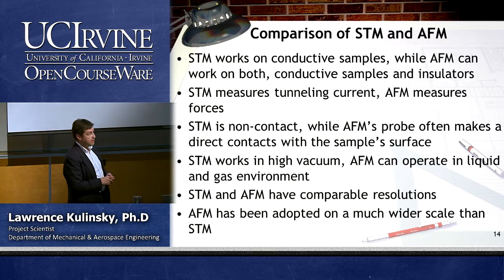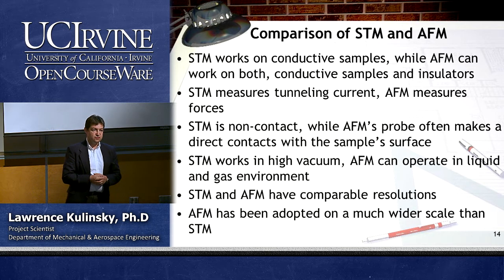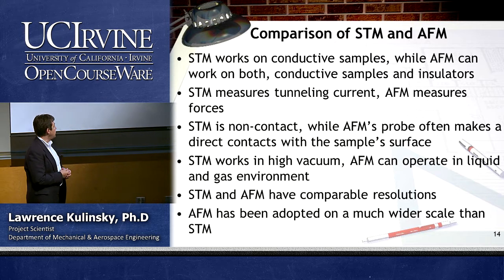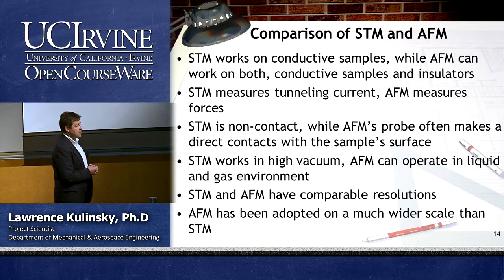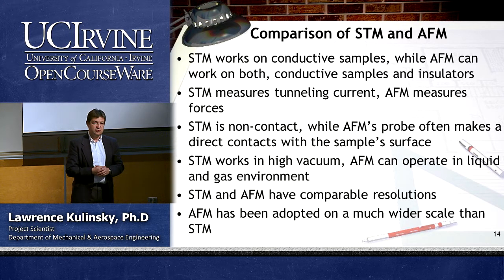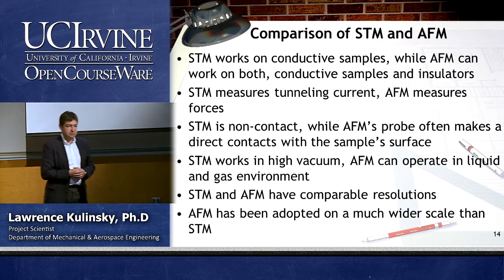This is the big one. STM works in vacuum, okay, which basically limits somewhat its usefulness. Well, AFM can operate in liquid and gas environment. They both have comparable resolution. If resolution is your goal, people actually prefer STM still.